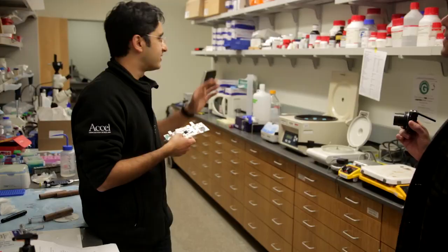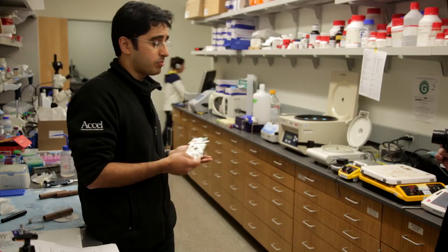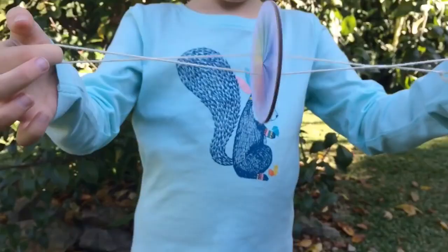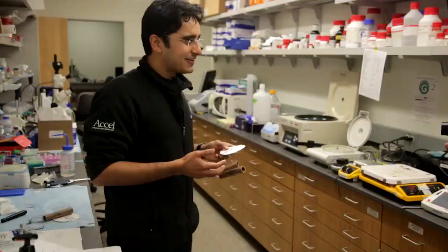So the design problem statement was: I want something less than a dollar, preferably made out of lightweight materials like paper, easy to carry in your pocket, that matches the speeds of these devices. You think about different gears and mechanisms, go into your kitchen and backyard and start thinking about toys. We looked at yo-yos, egg beaters, and others thought about salad spinners. What we found in this whirligig toy serendipitously is that it's one of the most efficient ways of converting your energy into rotational energy — and that was the aha moment. Using strings as actuation in the middle rather than mechanical gears. As soon as I saw that, in 10 seconds you know in the back of your mind this is something powerful — it transitions beyond a toy to something with really important applications in global health.